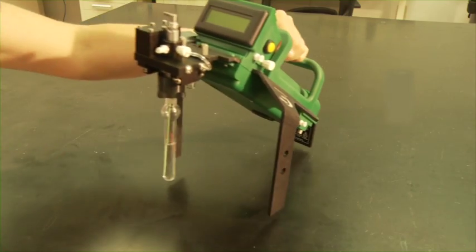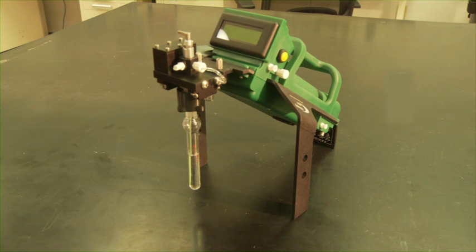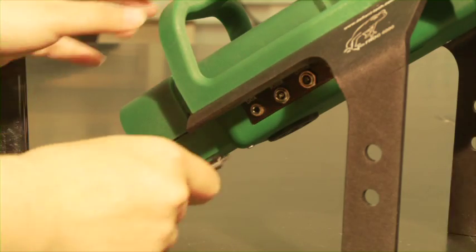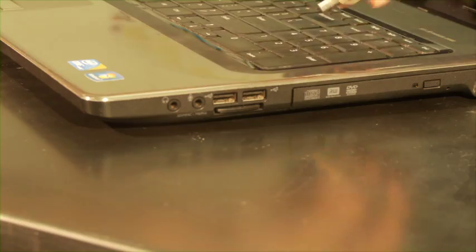To begin the calibration, set the Frog in an area either inside or outside where the air is relatively clean. Next, connect the Frog to your computer and start up the Elvin software.